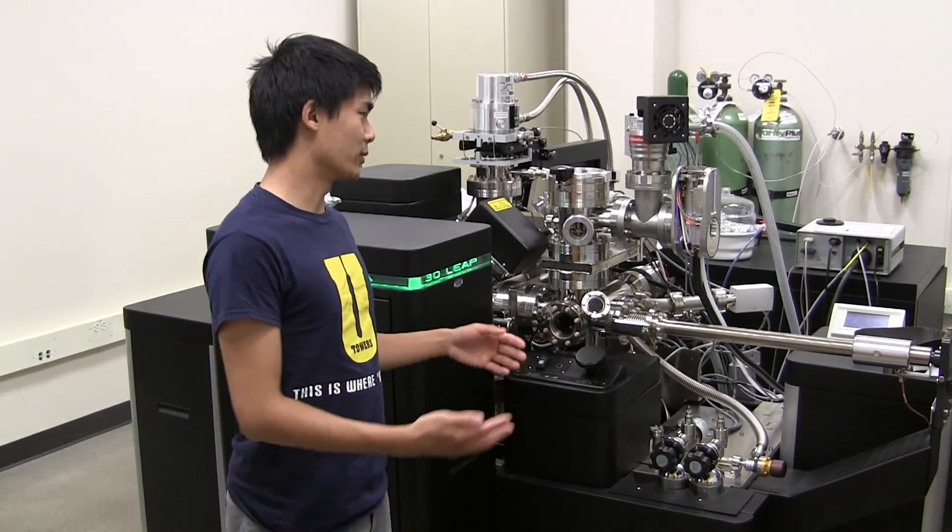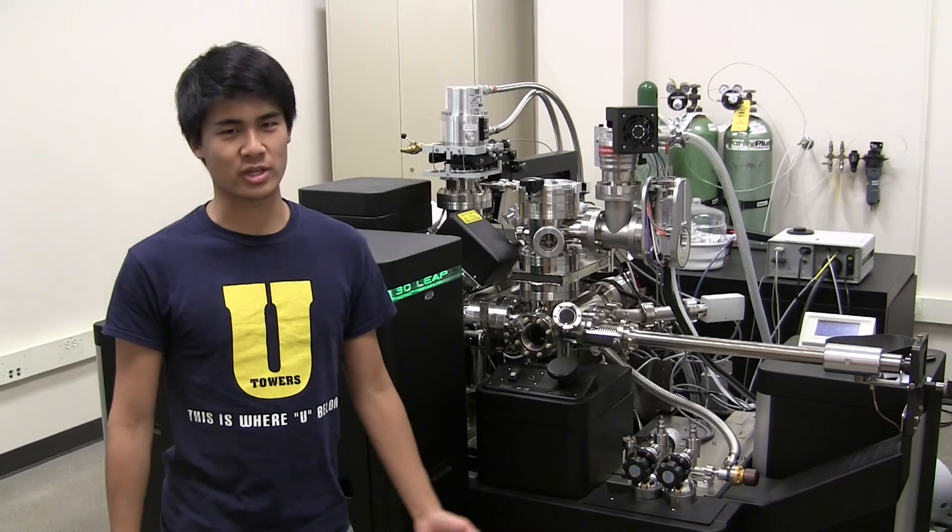All right. So we're in EMAL, stands for Electron Microbeam Analysis Laboratory. This is where you can find all the really fancy instruments that undergraduate students shouldn't be touching. Yeah. Here you're going to find the atom probe. Let's go check it out. All right. So we're at the atom probe. This is where the magic happens.